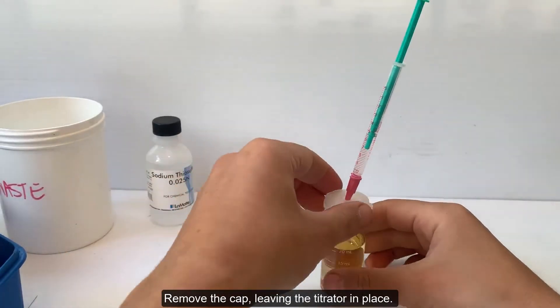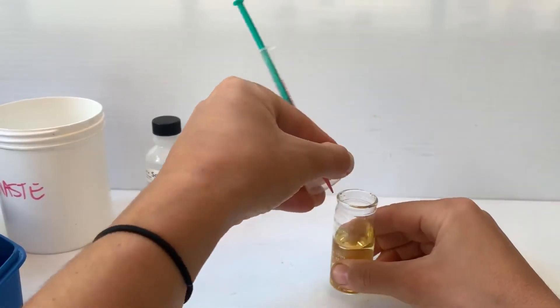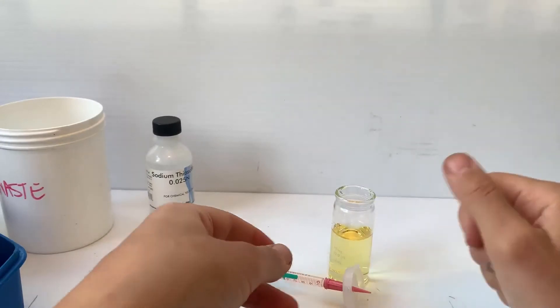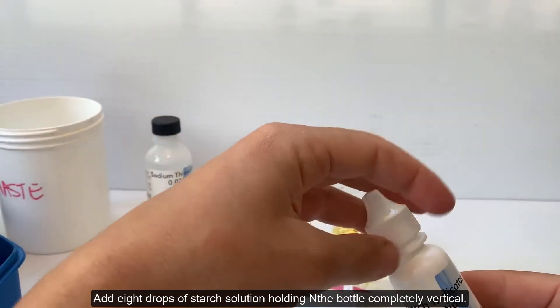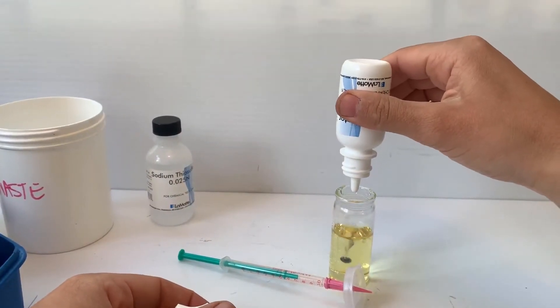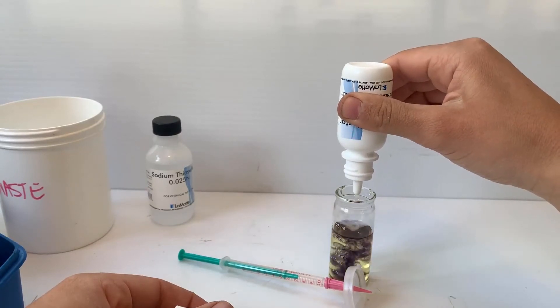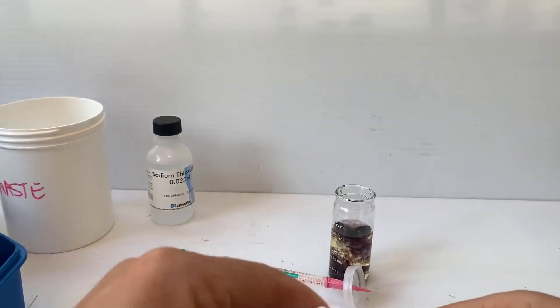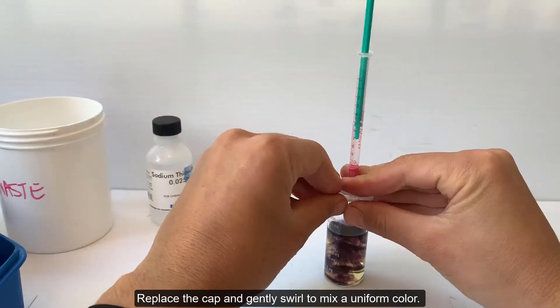Remove the cap, leaving the titrator in place. Add 8 drops of starch solution, holding the bottle completely vertical. Replace the cap and gently swirl to mix a uniform color.